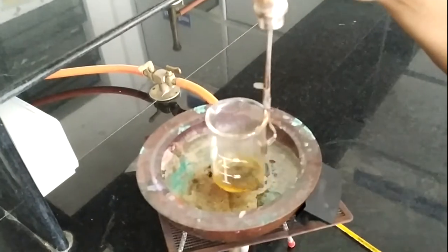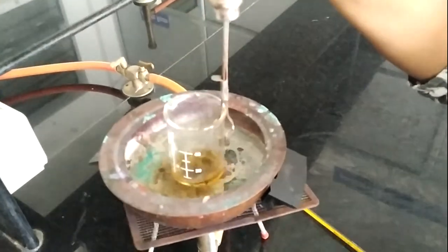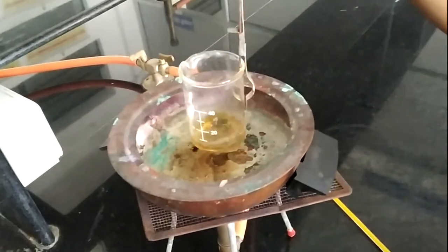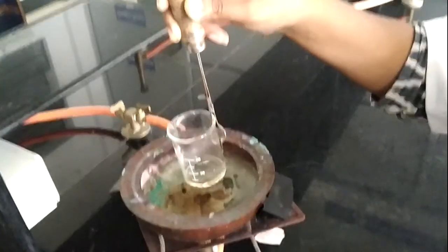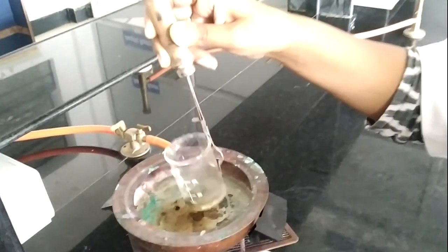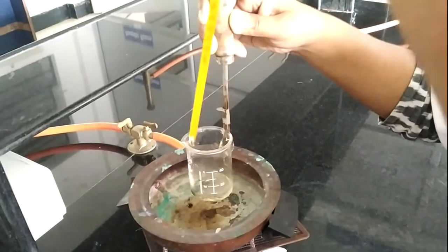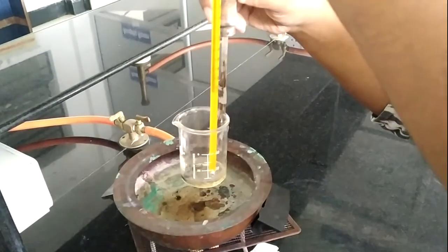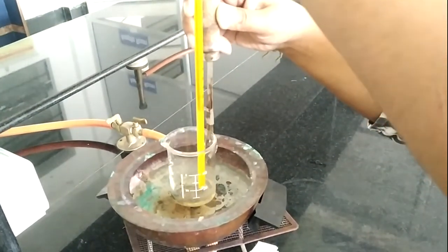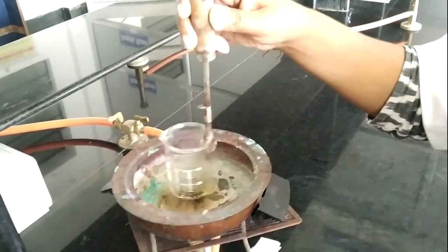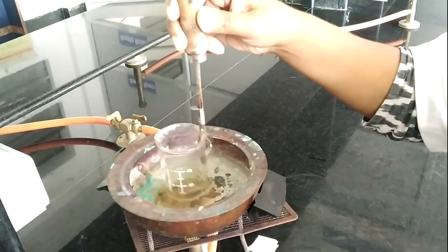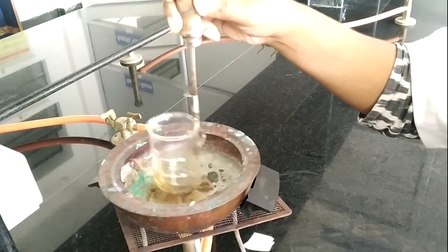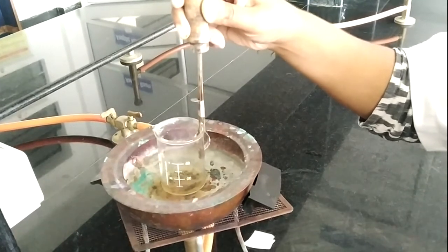Now we proceed for the heating part. I proceed with heating the iodine solution and we will heat it till the brown color disappears. Now the brown color is almost going to disappear. I measure the temperature, it reaches almost 50 degrees Celsius, so I am going to add the yellow soft paraffin into it. Previously we will wait till the temperature reaches to 40 degrees Celsius.